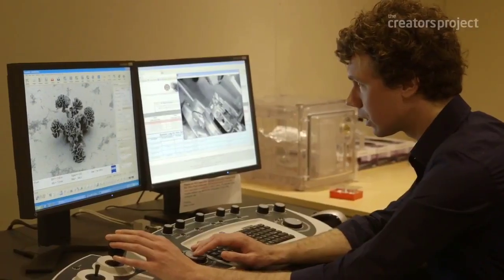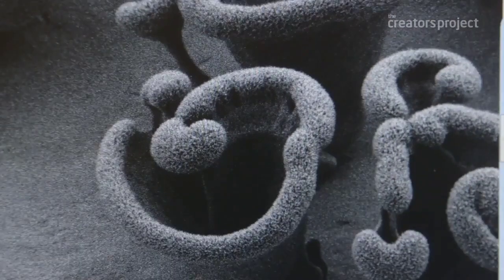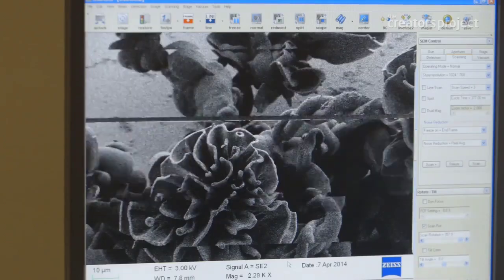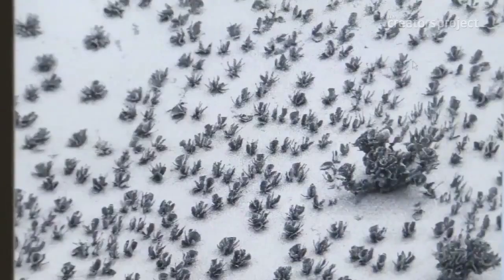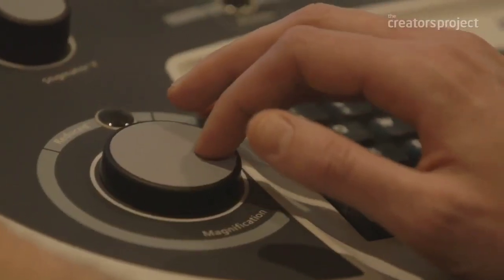For 3 years now, I've been looking at these very strange white stripes on plates that are maybe only an inch long or so. And every time I'm amazed that it is a complete sort of coral reef that you're diving into as soon as you look under the microscope. I notice quite often that I simply forget to make photos because I just want to look further and further on the samples and discover new structures and then get lost.